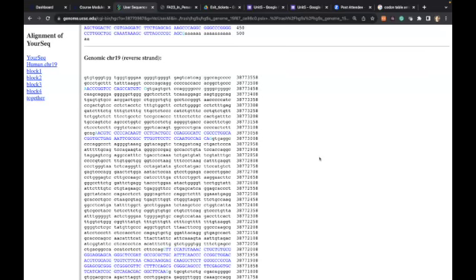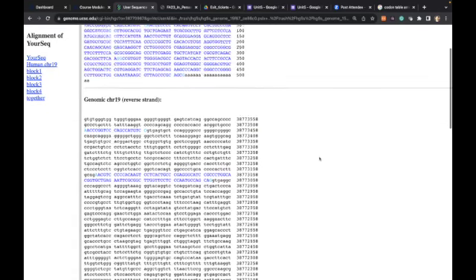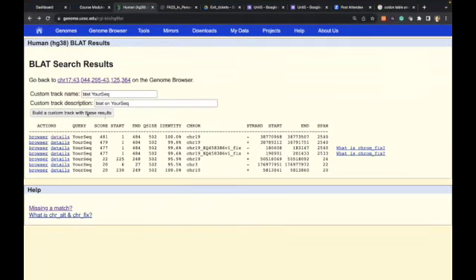Blue is the exon. Pardon? Blue is exonic because it's a matching region, but this is mRNA. mRNA is constructed from the exonic regions, so therefore it's exonic. I know here it's 100% match, but if it's an exonic region and it doesn't match, is it just blue and lowercase? Is there any blue and lowercase? No, because this is 100% match. Yeah, that's right. Let's look at that. That's a good question. Here is the non-matching 99.8%.